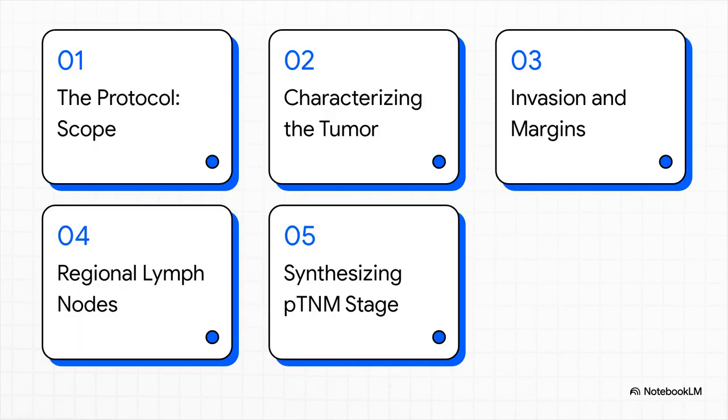We're going to follow this specimen's journey from the moment it arrives. First, we'll figure out if this protocol even applies. Then, we'll dive into the tumor itself, check out invasion and margins, hunt for positive lymph nodes, and finally, put all the puzzle pieces together for that final PTNM stage.